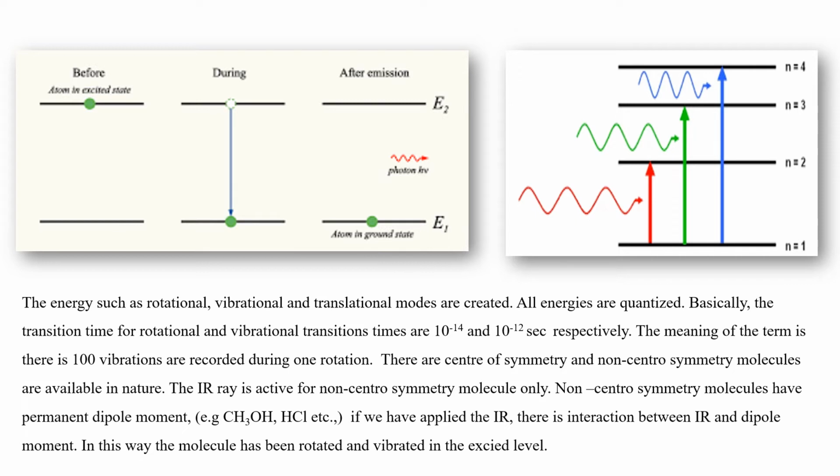So if you apply infrared rays, there is an interaction between the infrared ray and the dipole moment of that heteronuclear molecule. This way, the molecule is rotated or vibrated into the excited state, but it should be inactive for centrosymmetric molecules.